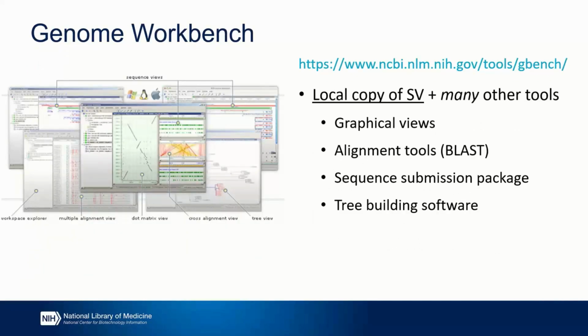The next tool is the Genome Workbench, which at its core is really like a local copy of the Sequence Viewer, which you can, by nature of being a local copy, download to your own computer and use. However, it's also a lot more than just that. It also provides several other packages that you can use to help give yourself a one-stop shop for a complete analysis of your data, as well as analyzing other sequences stored within NCBI.